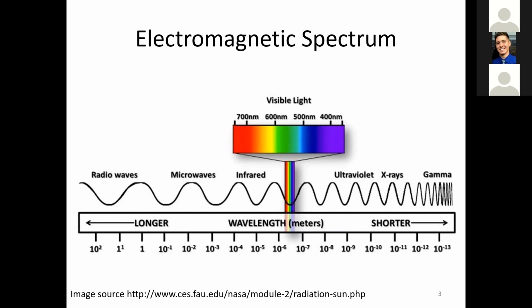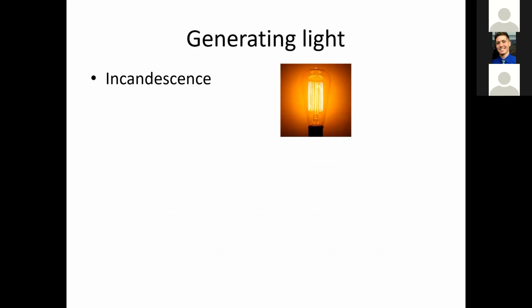So when we talk about fluorescence and photons emitted and excitation photons, we're really talking about a small portion of the electromagnetic spectrum. On the long end, from about 800 to 850, on the short end, about 350. So in terms of the entire electromagnetic spectrum, visible light is a very, very small portion of that. Of course, as we go from long wavelengths to short wavelengths, we see an increase in energy, and we're going to use this to our benefit.